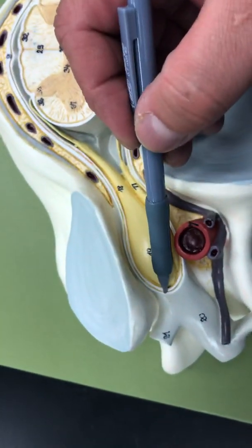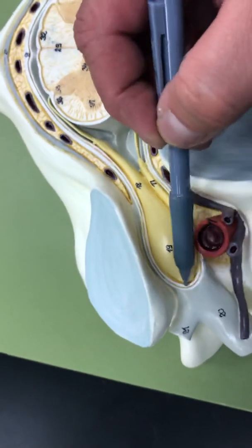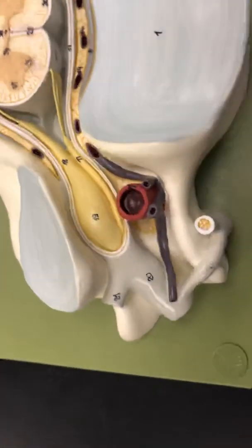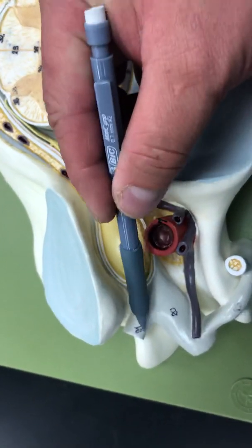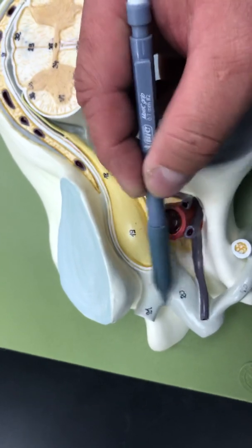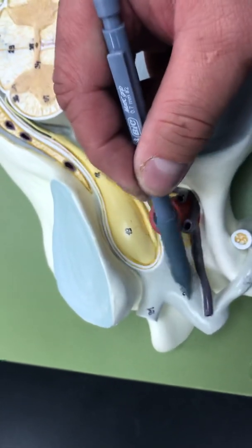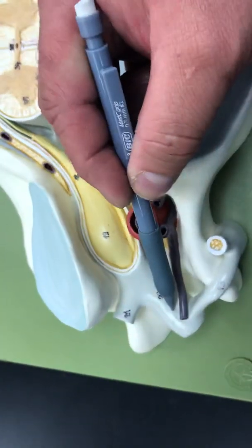As we exit outwards, this region right here is where we form the spinal nerve. At the spinal nerve level, all the sensory and all the motor signals start to mix with each other. So by the time we exit out and form the dorsal and the ventral ramus, all of these fibers are now mixed. The dorsal ramus has sensory and motor signals going through it. You're going to have the ventral ramus, and it's also going to contain sensory and motor signals.